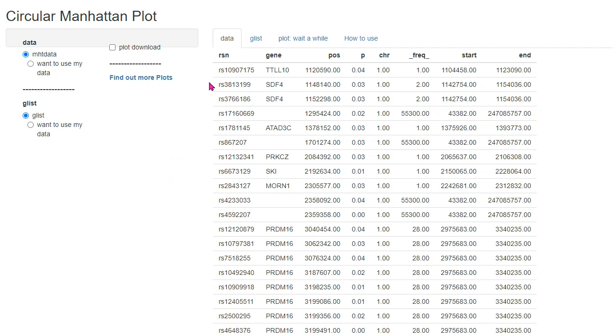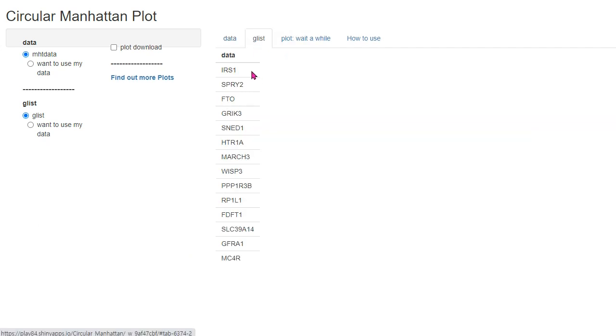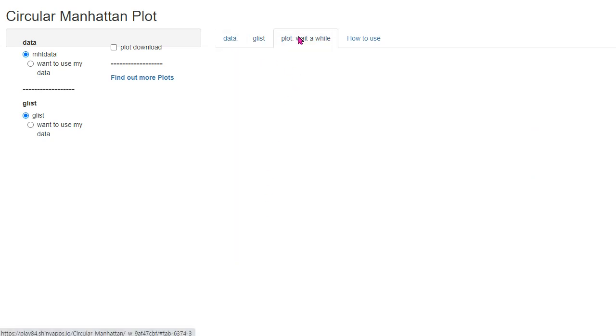Here is an example file and another file is a list of genes here, and then you can get the plot. It takes a little while because it has much information of total genes.